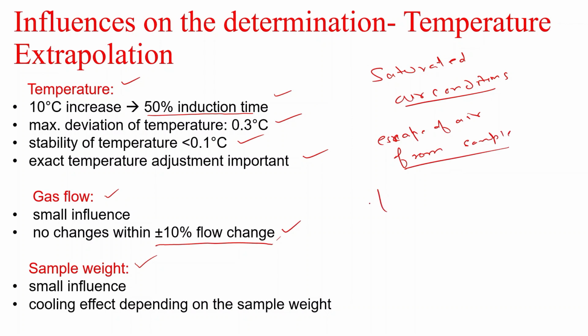That is, if more turbulence of air is there, then air will escape rather than causing the oxidation of the sample. So we have to optimize the sample size and the airflow rate.